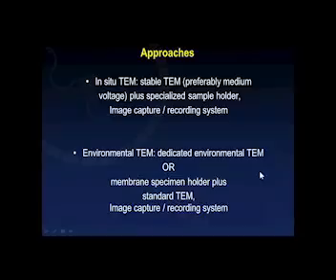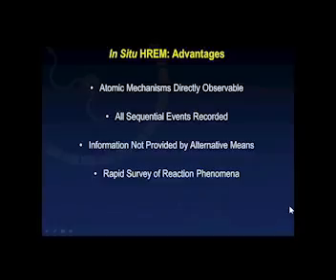The approach for in-situ TEM includes a stable TEM, preferably a medium voltage microscope, because with thin samples, there is more structural detail and more quantitative information that can be resolved. Plus, one would need a specialized sample holder, as well as an image capture or recording system. The second approach, which is for environmental TEM, can utilize either a dedicated environmental TEM instrument, or you can use a membrane-based specimen holder. And of course, you would also need a standard microscope plus image capture recording system.